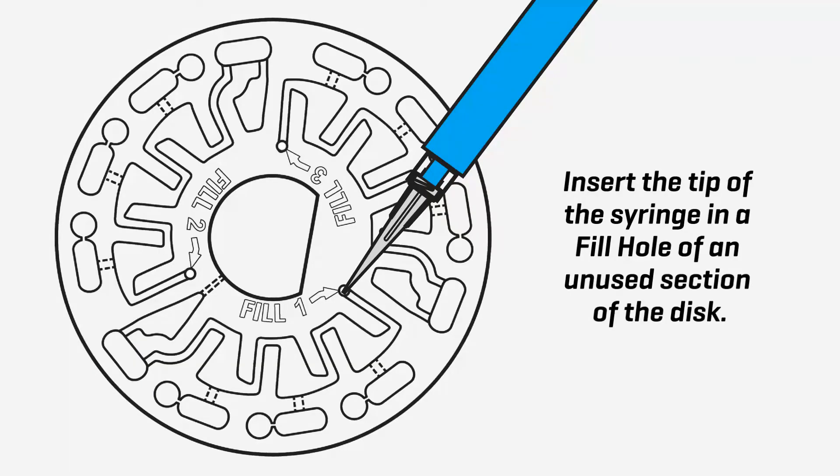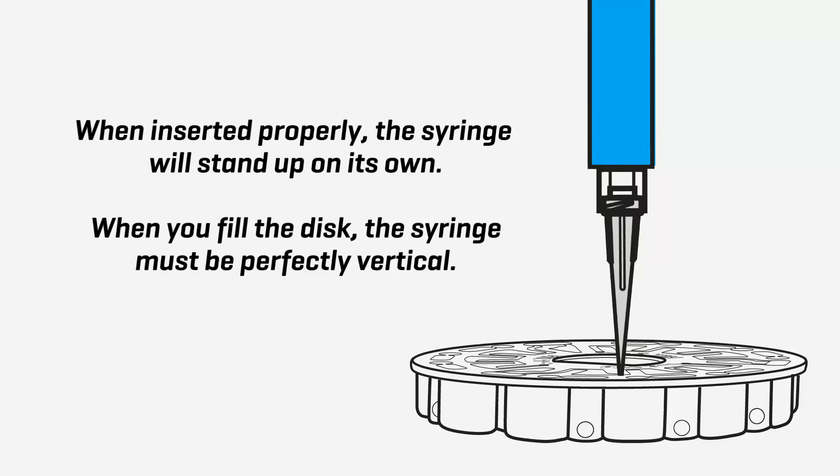Insert the tip of the syringe in a fill hole of an unused section of the disc. When inserted properly, the syringe will stand up on its own. When you fill the disc, the syringe must be perfectly vertical.